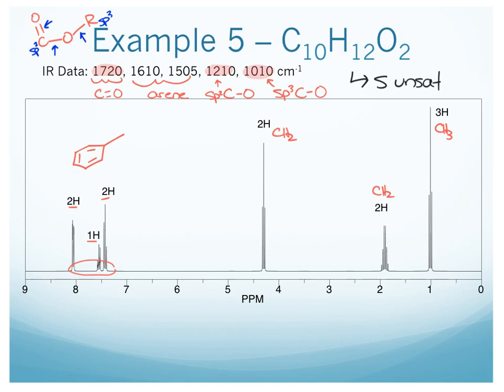So that must mean we have a carbon with no hydrogen. There's number 10. We've accounted for all 12 hydrogen, and then we have 2 oxygens that aren't accounted for. So let's just write those oxygens down so we have those fragments listed out.